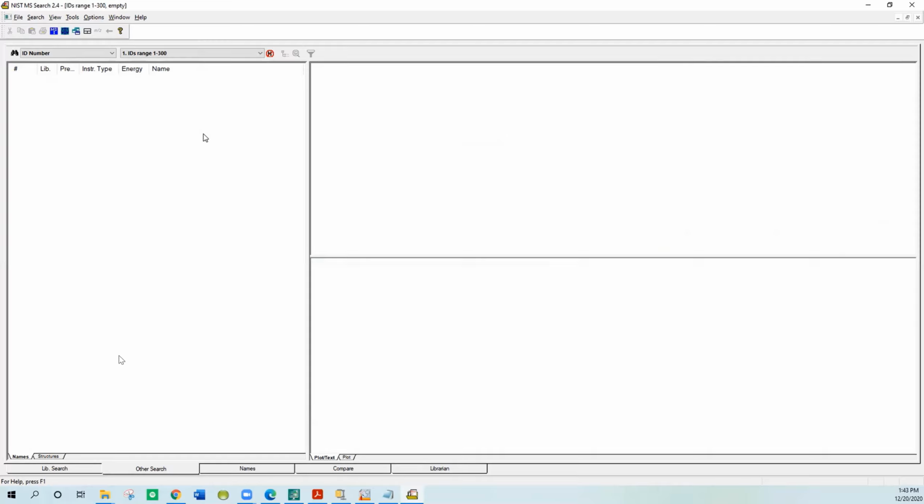Now, if you want to do a hybrid search of this particular database, you'll have to export it and bring it back in. So you export it as SDF or MSP with mol files, as described in my detailed text, and bring it back in, because that's the only way to create the hybrid loss indices you need to do the hybrid search. If you want to do the similarity search or the one that's just matching the spectra, then it doesn't matter as much. But the hybrid has some special indices, so you have to create those. And when we were doing EI, you could re-index this EI hybrid search, but they currently do not have a similar command for indexing the MSMS hybrid searches.